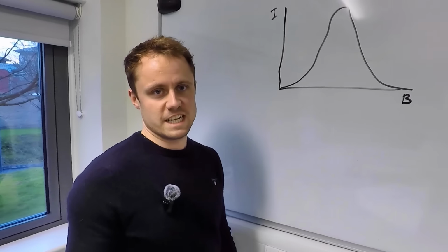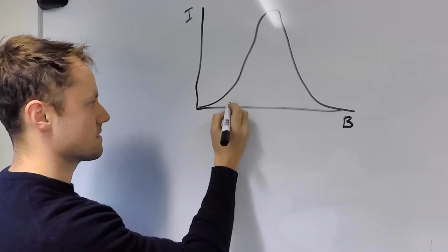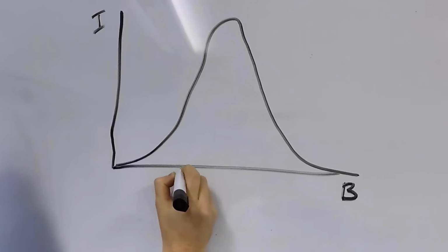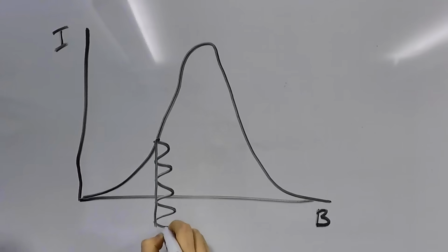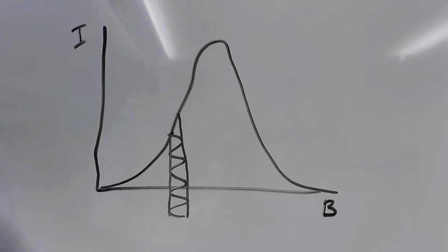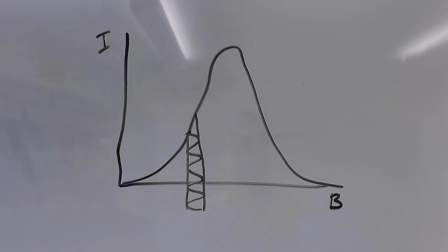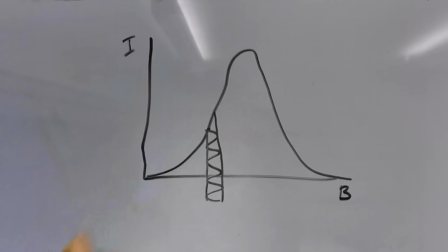So in our experiment, we are modulating the magnetic field, which means we're applying some oscillating signal, say like this, which has some amplitude like that, and then we, as a result, measure some oscillating response back to that according to its position on this curve here.